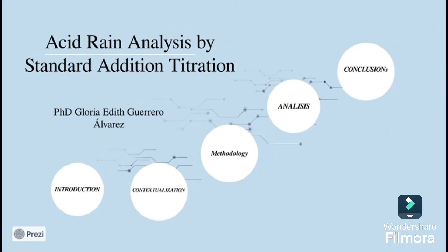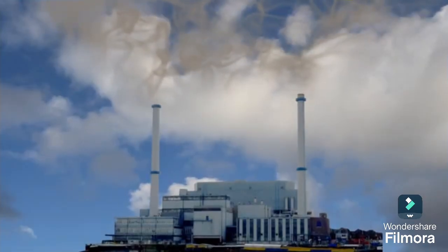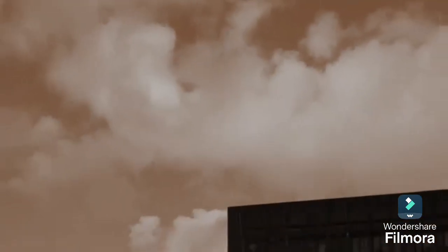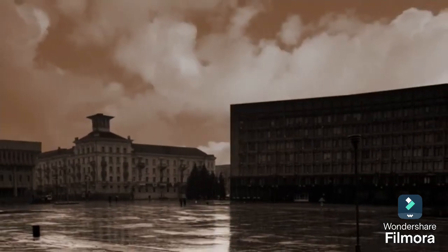Contextualization. Acid rain affects many regions around the world, mainly caused by the emission of sulfur and nitrogen oxides that react in the atmosphere to form sulfuric and nitric acid. These pollutants come from industries, vehicles, and energy production.